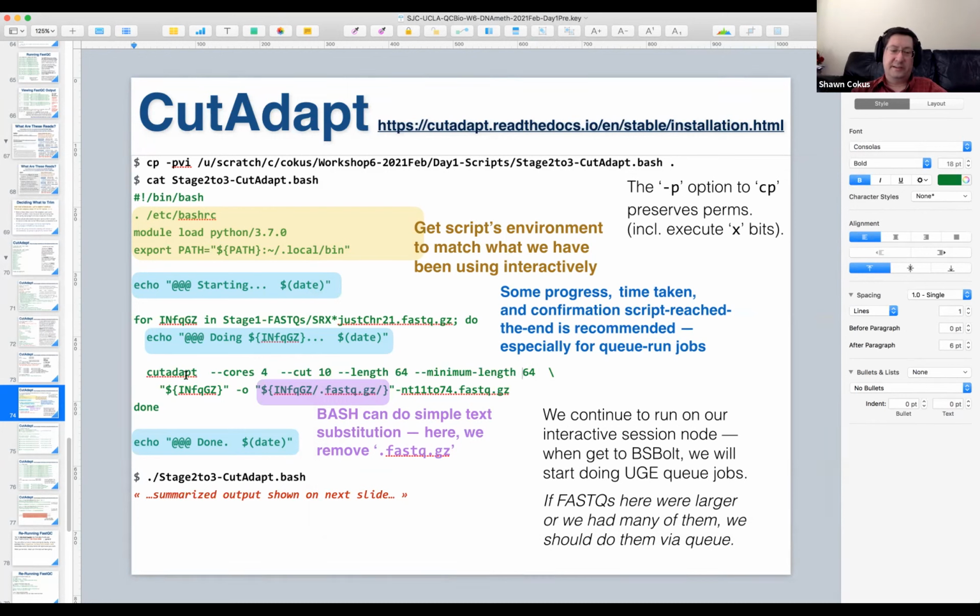I'm actually writing this long command line on 2 lines. So the backslash at the end of this line means this line continues to the next line. You could also just type this all in one really long line. Eventually your pipelines get so long you don't really want to pack them in one line. Eventually you have to use white space and indenting to have some sanity in your complicated lines, and the backslash line continuation lets you build up complicated lines where you have some control over the formatting.